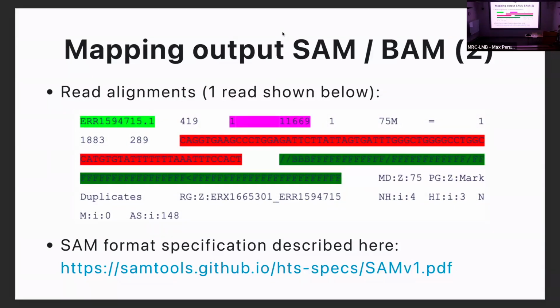So some of it will look familiar. You'll have in the red, you can see your sequence, and that's ported over from the FASTQ file. And then you can see the quality score. And then here you can see the header from the FASTQ file. And there's other sort of metadata here that's interesting. But key is the thing I shaded in purple, which tells you the chromosome to which this read mapped and the position, okay? And for every read that you map, in your BAM file will be all this information, and it will contain the location to where the read mapped. So that's the BAM file. That's what you've made by the mapping process.